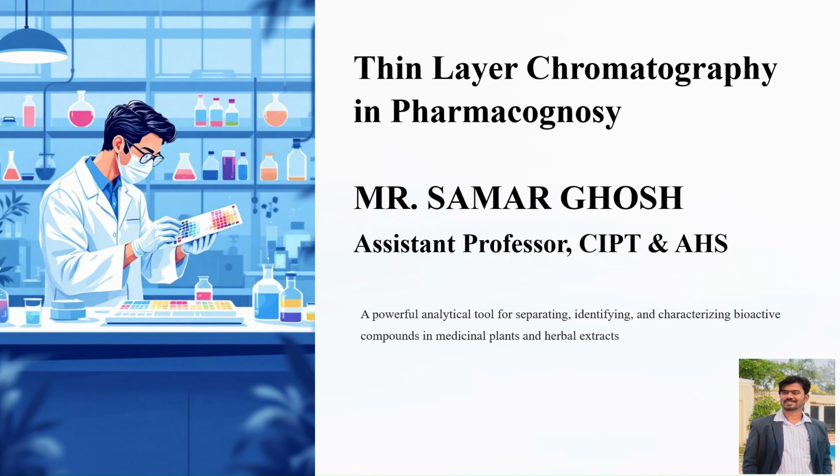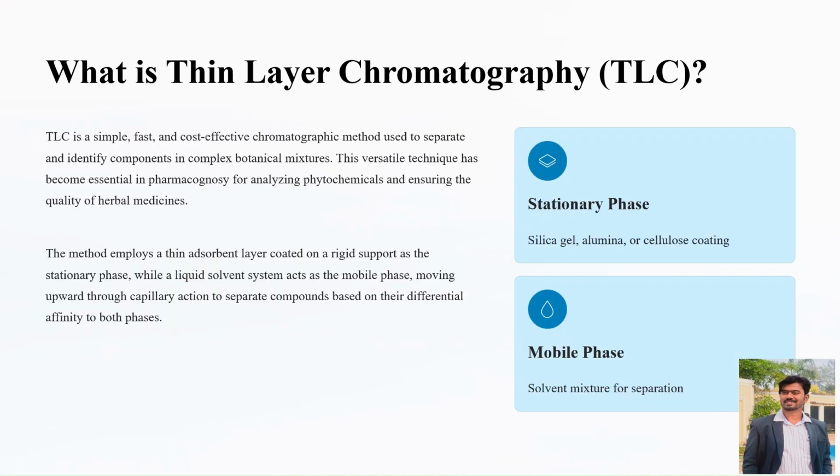Now, TLC is a powerful analytical tool for separating, identifying, and characterizing the bioactive compounds in medicinal plants and herbal extracts. Now, coming to the next slide. Introduction. TLC or thin layer chromatography is a planar chromatographic technique used to separate non-volatile mixtures into their individual components.